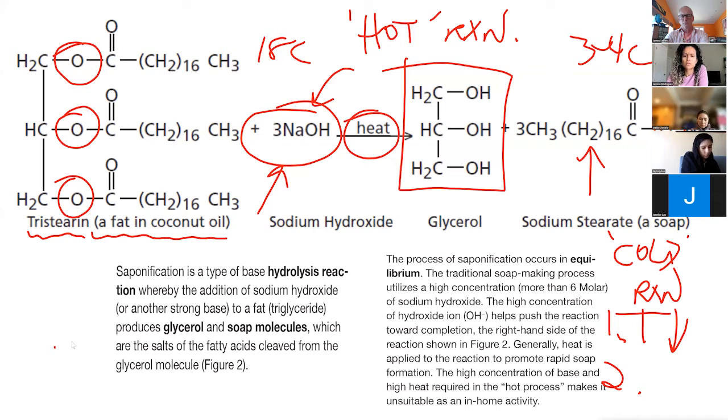Was it the sodium hydroxide concentration? Exactly. We're going to be using a much lower sodium hydroxide concentration. So our sodium hydroxide concentration is going to be about 1 molar rather than 12 molar. And if you decrease the concentration of the reactants in a reaction, what typically happens to the reaction rate?